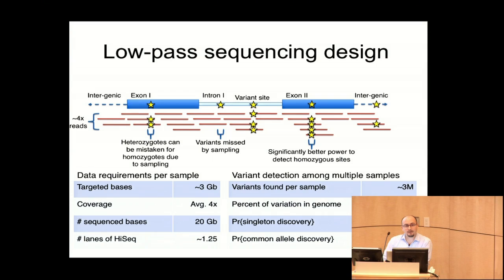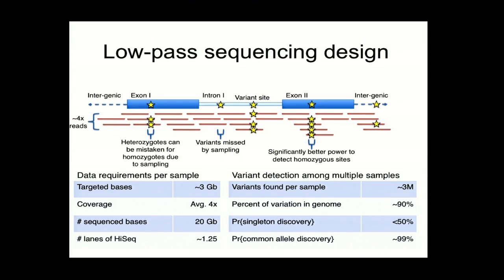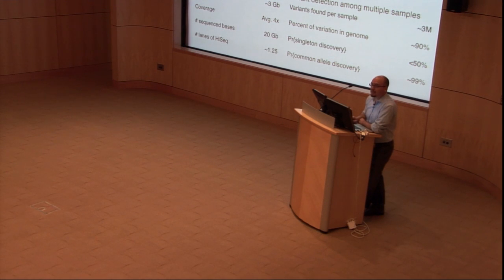Most of our samples are above 4x. It's to the point where, when we measure our coverage, we have to cap the sequence coverage in the averaging of the average coverage per population at 5, because so many samples are at 10. And so you don't want to skew your average coverage up. So this is enough of a problem already that people are just throwing the samples on sequencers, and we're getting 6, 8, 10x coverage in many of the new samples.